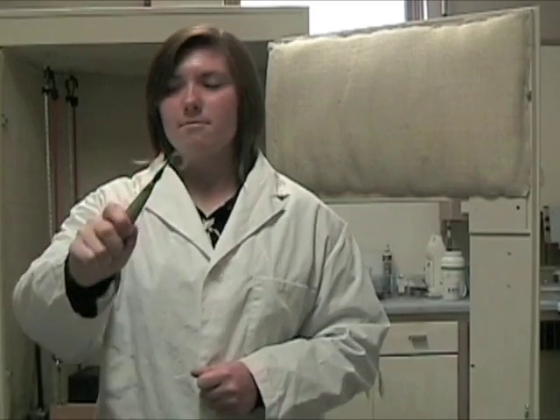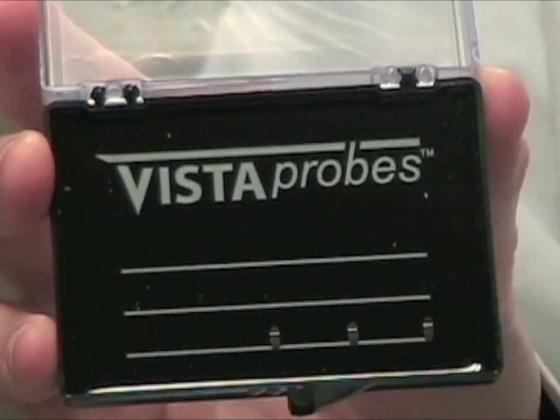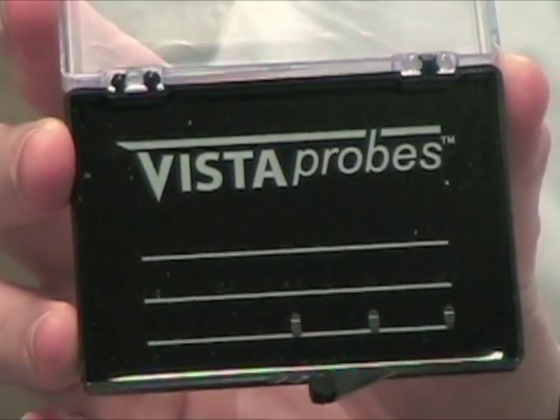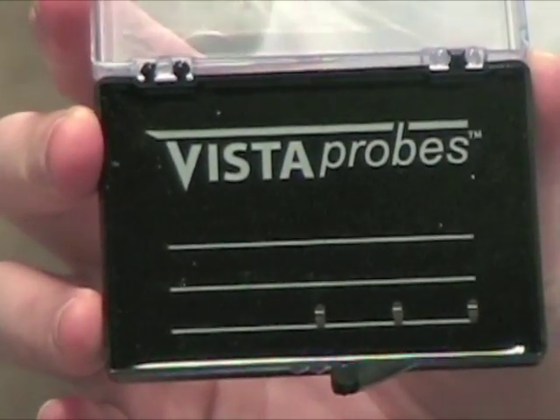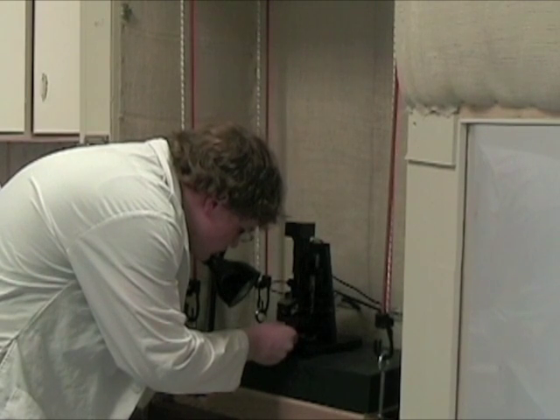This is a 2 centimeter by 2 centimeter sample. This is the box with the probe holders and the barely visible probes. The student in the laboratory will have already prepared and mounted a similar sample on the platform. The cantilever with the probe is placed in position close to the surface of the sample.